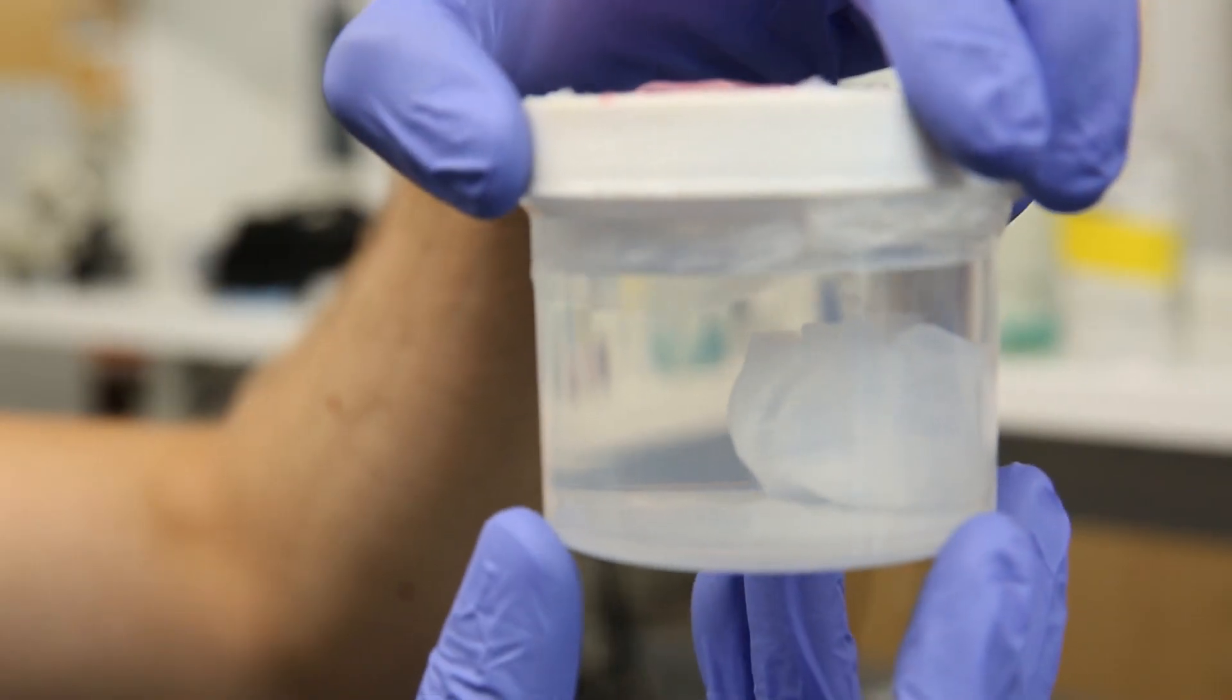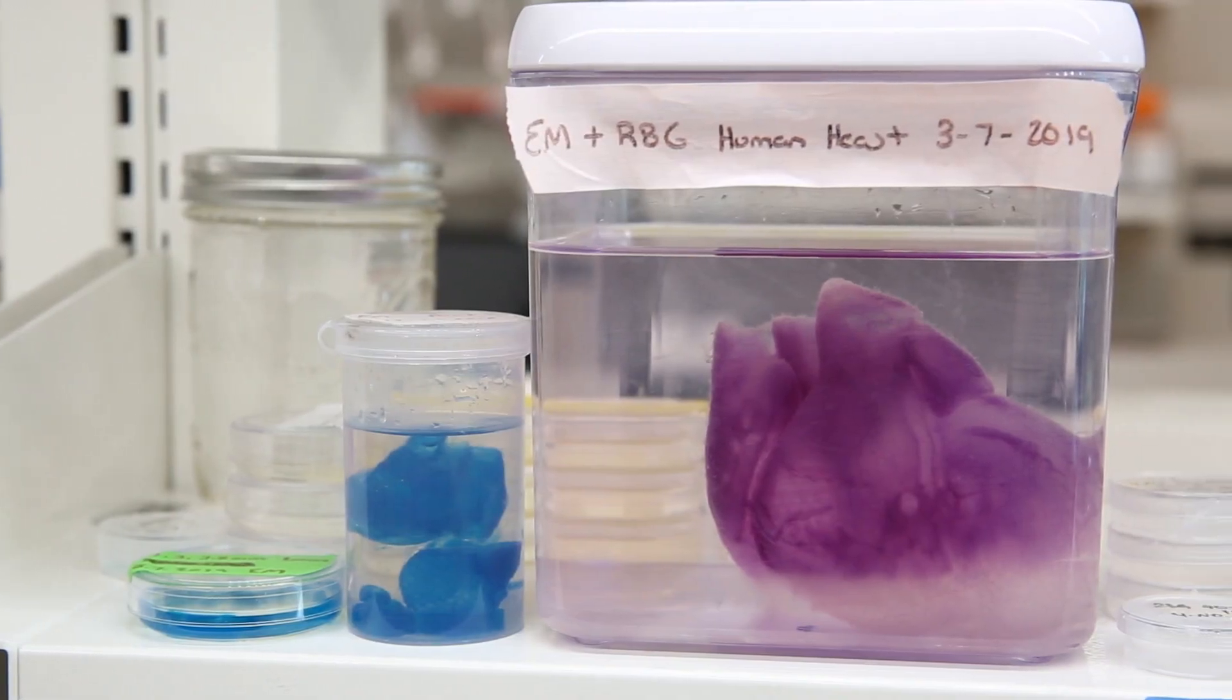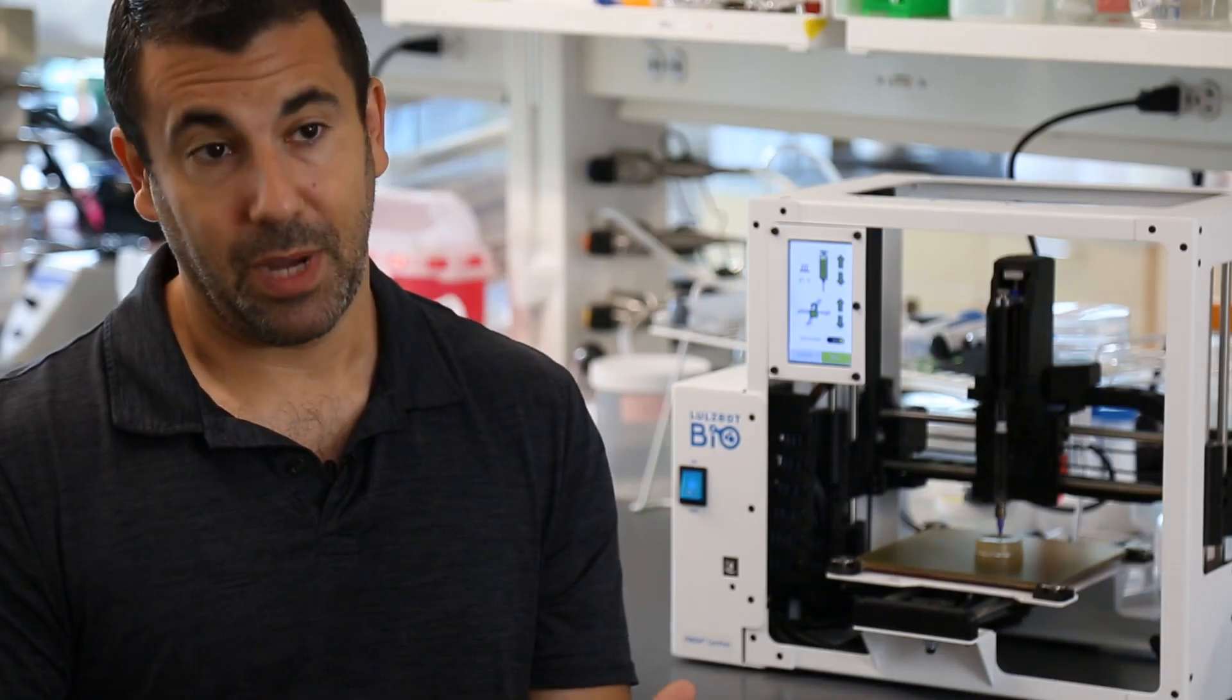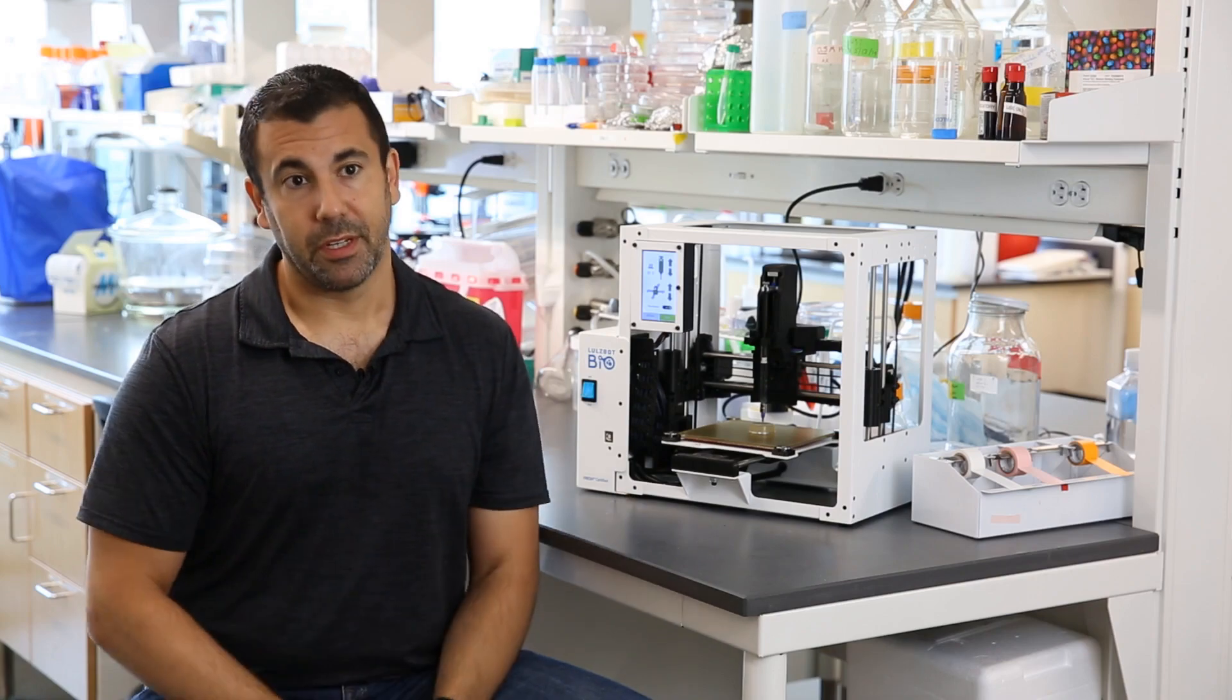We developed a way to 3D print collagen with pretty high spatial resolution. Collagen, which is the major material of the human body, has been really challenging to bioprint and that's where the FRESH printing technology comes in.